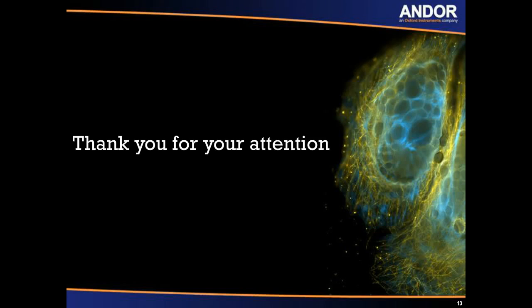entire brain. And the major issue using this approach is how you handle the data, because you're talking about terabytes of terabyte-size files that you need to handle for visualization and in order to do your processing according to the biological question that you have at hand. And this is a Raju Tomer paper that I mentioned in my presentation.